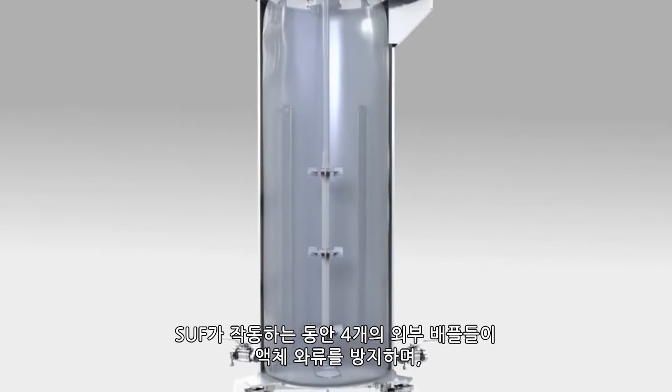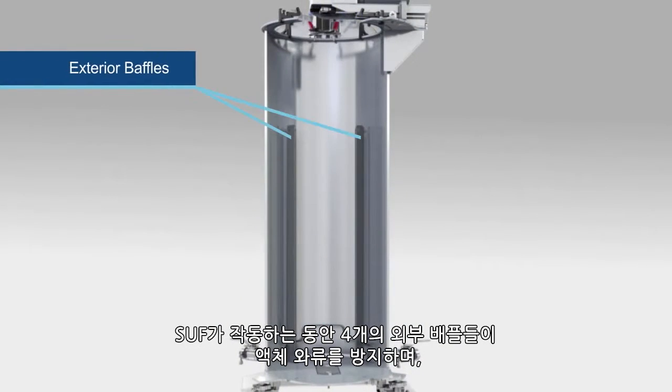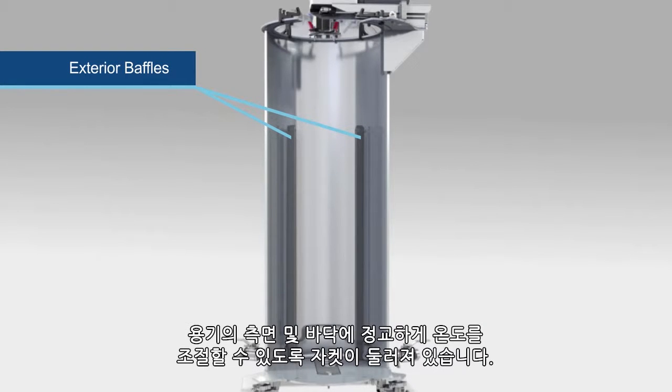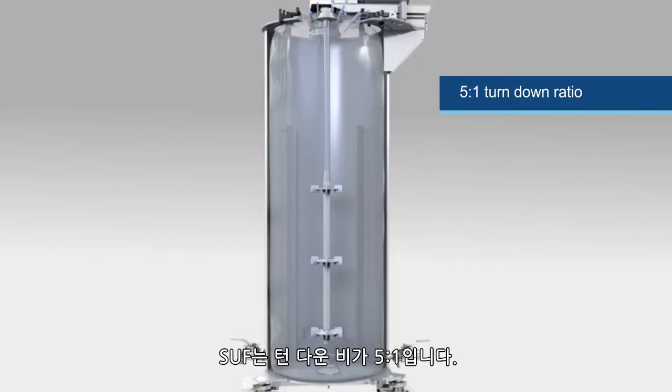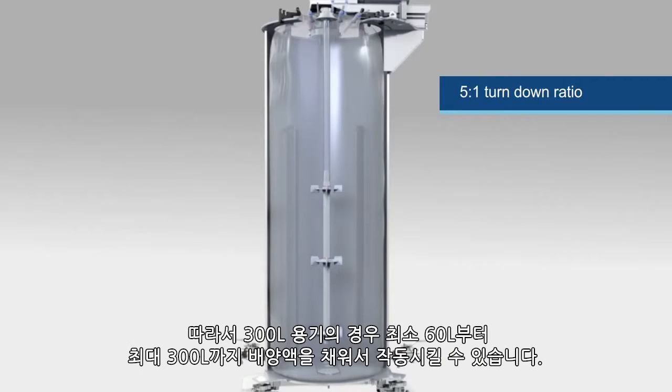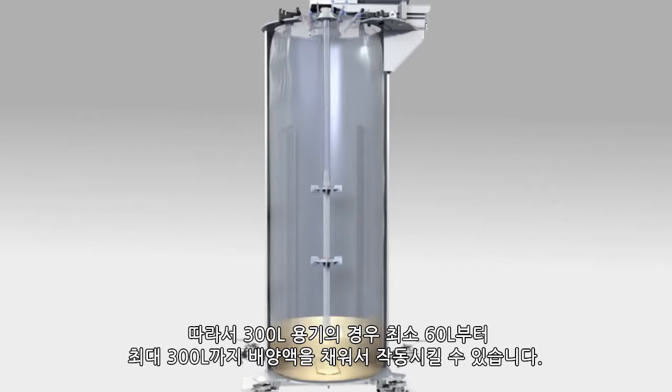During the operation of the SUF, four exterior baffles prevent liquid vortexing, and the vessel jacket supports advanced temperature control through the side and bottom jacketed vessel. The SUF has a 5-to-1 turndown ratio; therefore, the 300-liter vessel can be operated with as little as 60 liters and up to 300 liters.